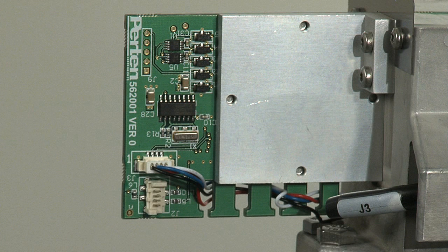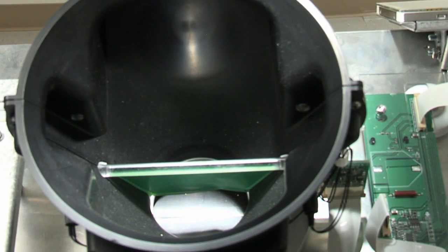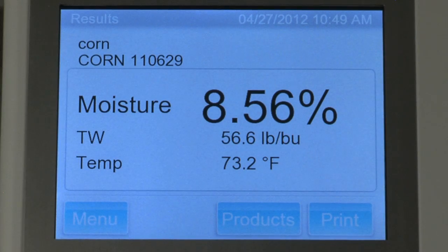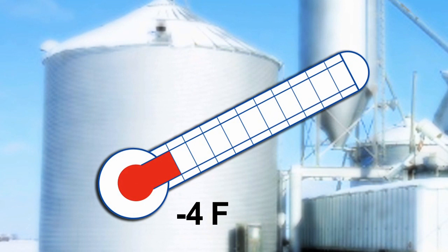Grain temperature is obtained quickly and accurately through direct contact with hundreds of kernels. The large surface area of nearly 7 square inches, coupled with the low mass of the detector, ensures grain temperature is measured fast and accurately, even for frozen grains at minus 4 Fahrenheit.